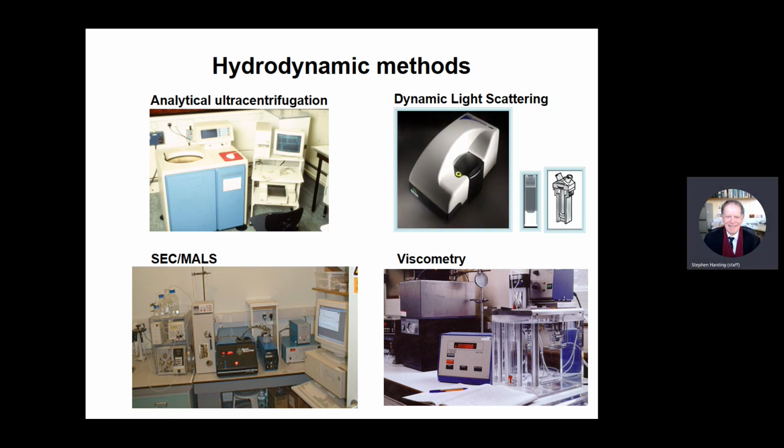laboratories. And then a variant of this is the electrophoretic light scattering, where you have these special cells where you can basically place a charge across the solution, and this is what we call electrophoretic DLS, and it's used for measuring what's called zeta potentials of solutions, which is related to the charge on the molecule.